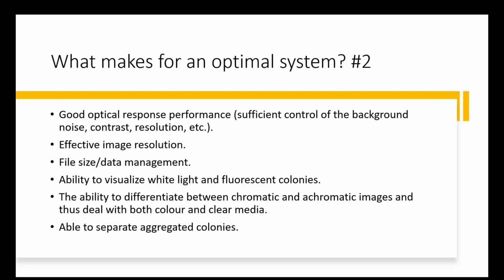We may want the option to count an entire plate or potentially sectors of a plate, depending upon if we're just doing, say, certain serial dilution schemes, for example. We also want relatively fast throughput, and certainly we don't want an automated method that takes far longer than a conventional counting method. And for looking at certain plates and wanting to show certain people, we'd want the ability to display on-screen images or capture photographs for later viewing.